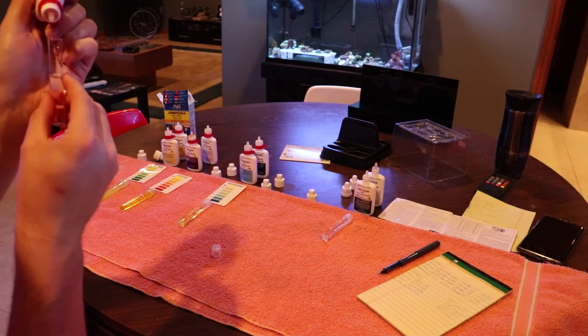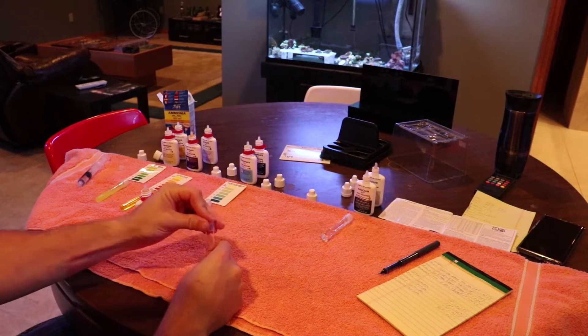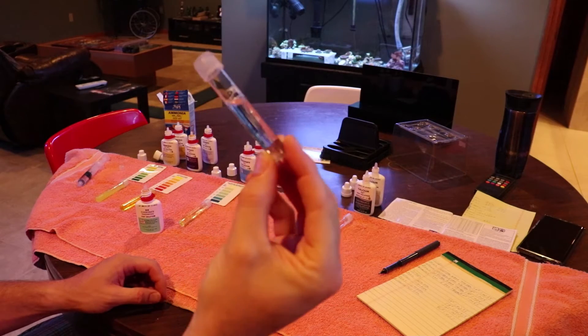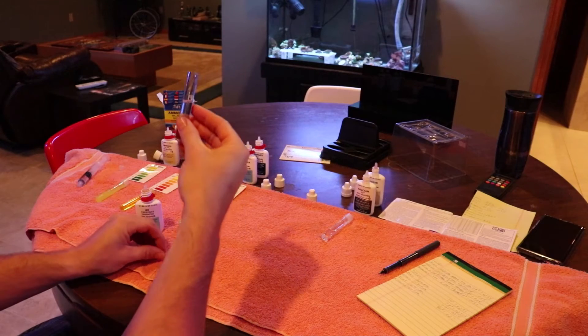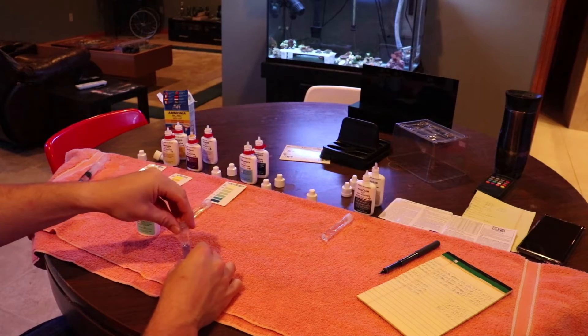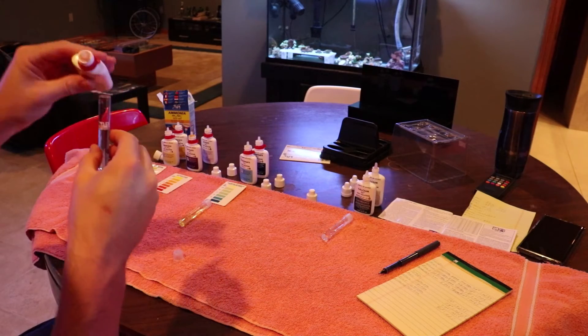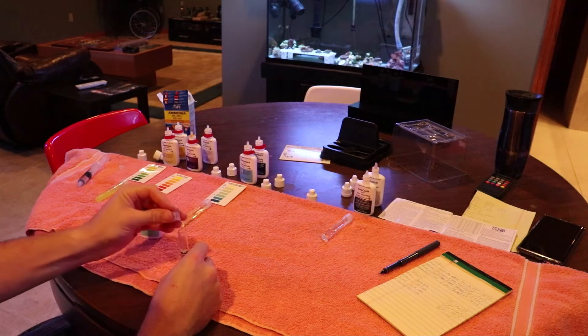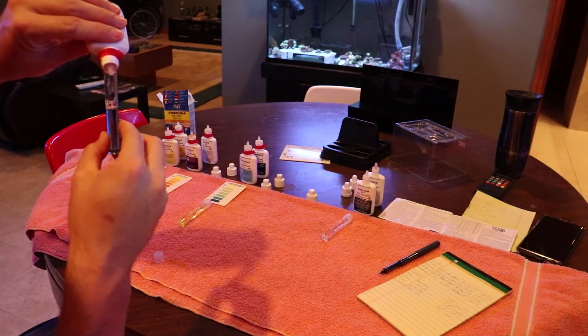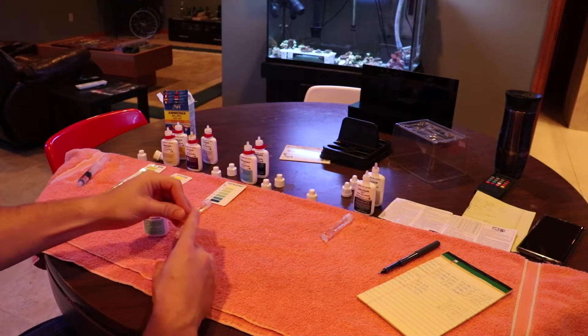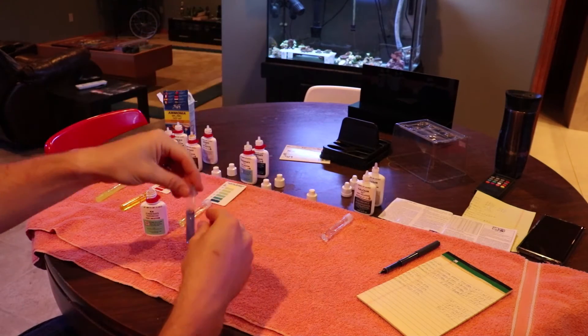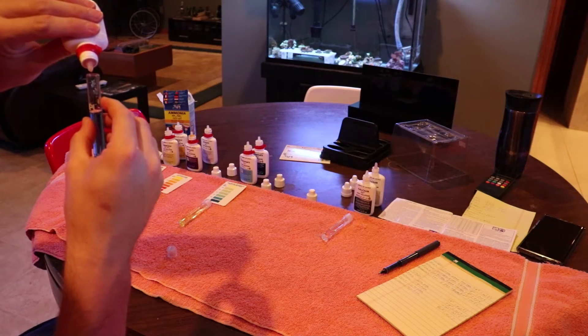We'll move on and test dKH next, which is our alkalinity. You want your alkalinity, your dKH, to be between 8 and 12. That's what I shoot for. You're going to add one drop to your vial and it should turn a light blue color. If it turns yellow, your dKH is less than one, which is not good. As long as it turns blue with one drop you're good. After that you're going to add one drop at a time. You're going to add a drop, put the cap on, shake it. Add a drop, put the cap on, shake it. You're going to keep track of how many drops it takes to turn from a blue color as you can see here to a pale yellow color. When the water turns to a pale yellow, the test is over.